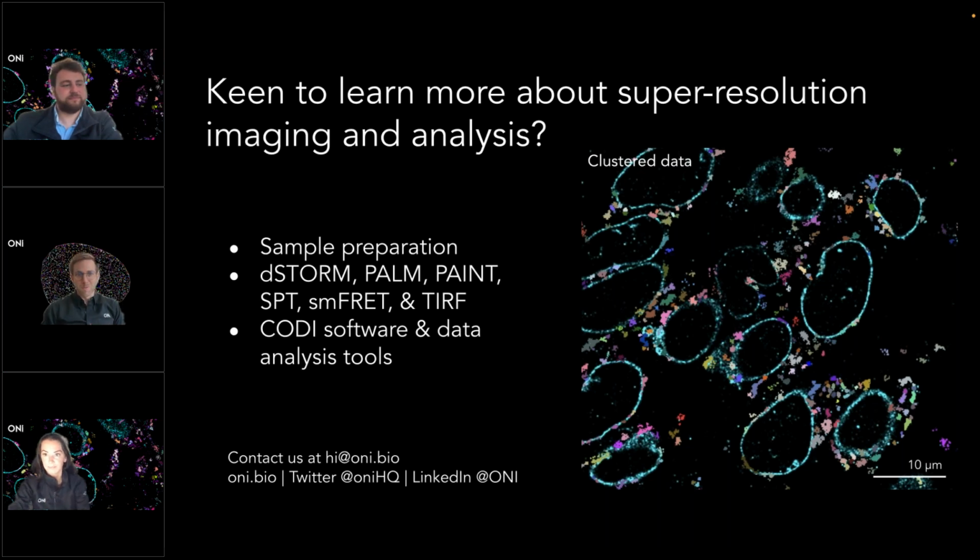It's really important that we're in single molecule conditions to do all this downstream quantitative analysis. But because dSTORM itself is stochastic, it's in the acronym, it's random about the blinking. We can't really control that there's only one fluorescent molecule in a diffraction limited spot on the camera. It's just a statistical random process.